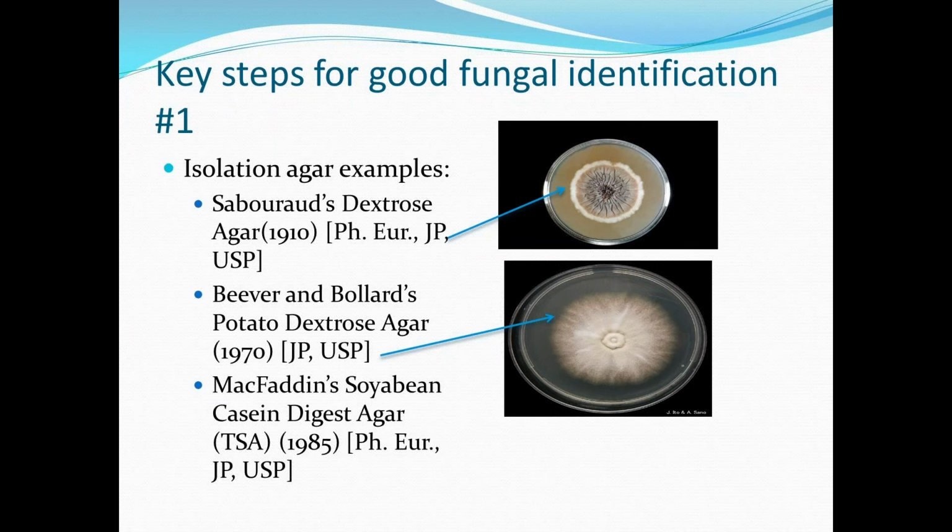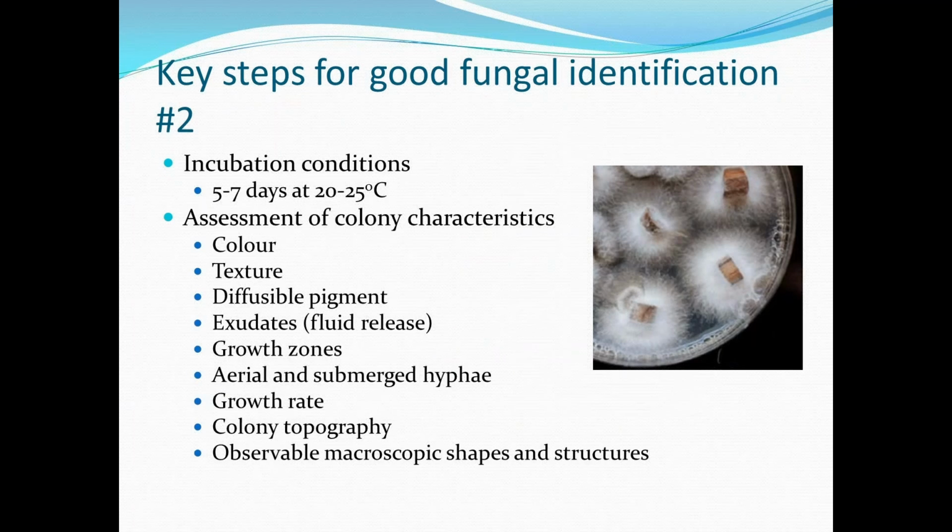Second point was that everything required a standard incubation time, because if there's variations in incubation times, then it would lead to different identification outcomes. So everything that we did was based on 5 to 7 days incubation at 20 to 25 degrees.